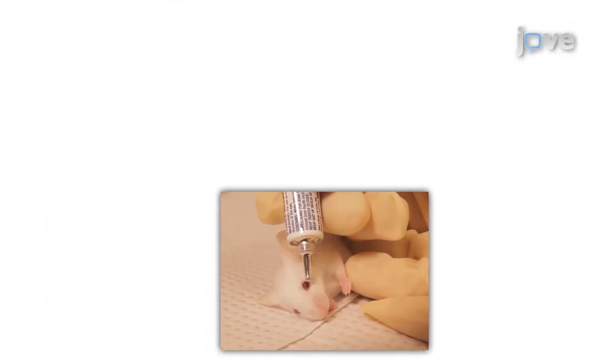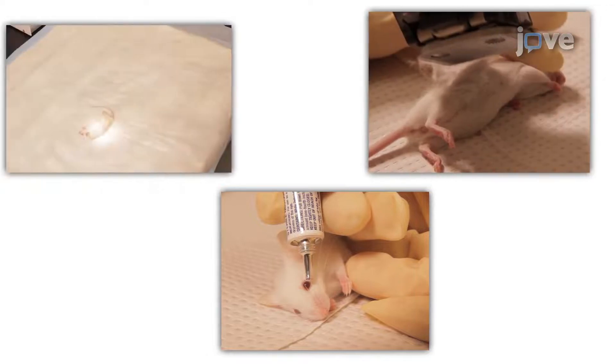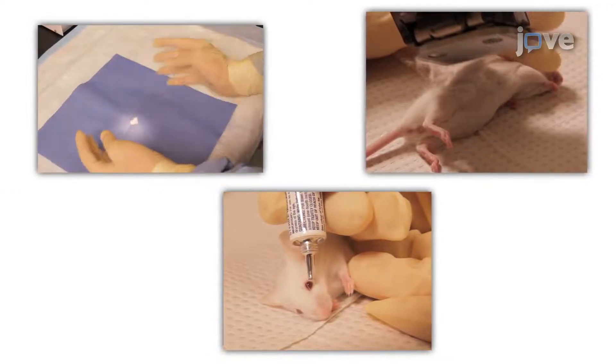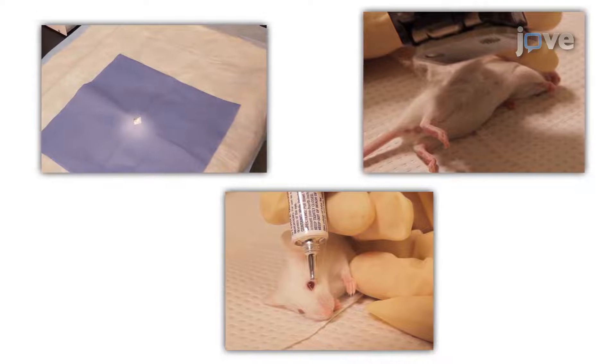Then, the steps necessary to prepare the animal and surgeon that will minimize the introduction of environmental contaminants and pain to the rodent are described.